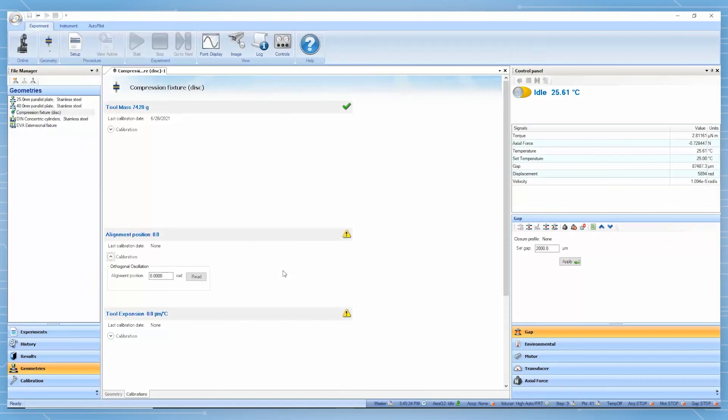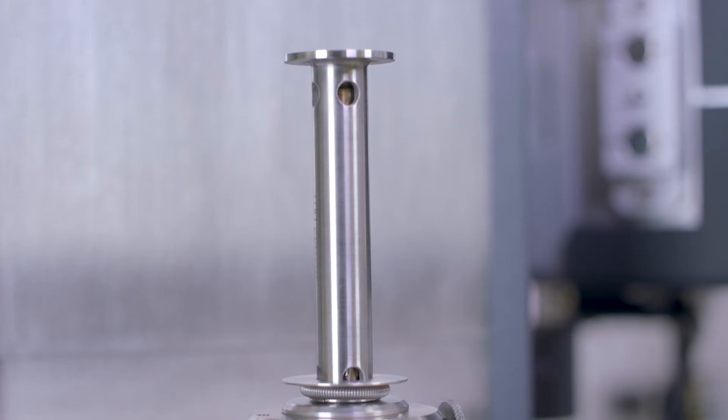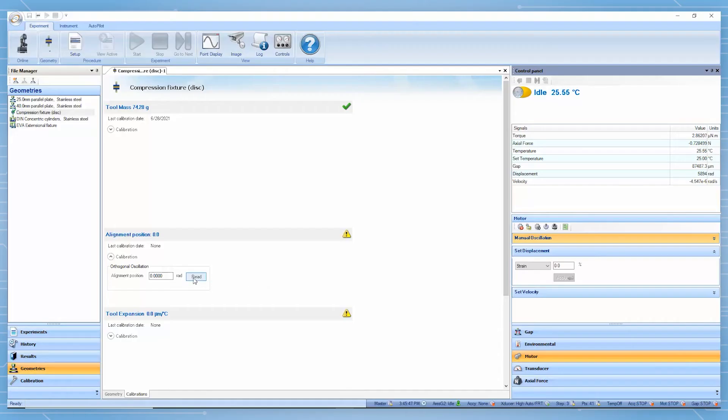The second step is to read the alignment position. From the instrument control panel, under the motor control bar, click on the go to home position icon and move the motor to its home position. Then, in TRIOS software, click on read.